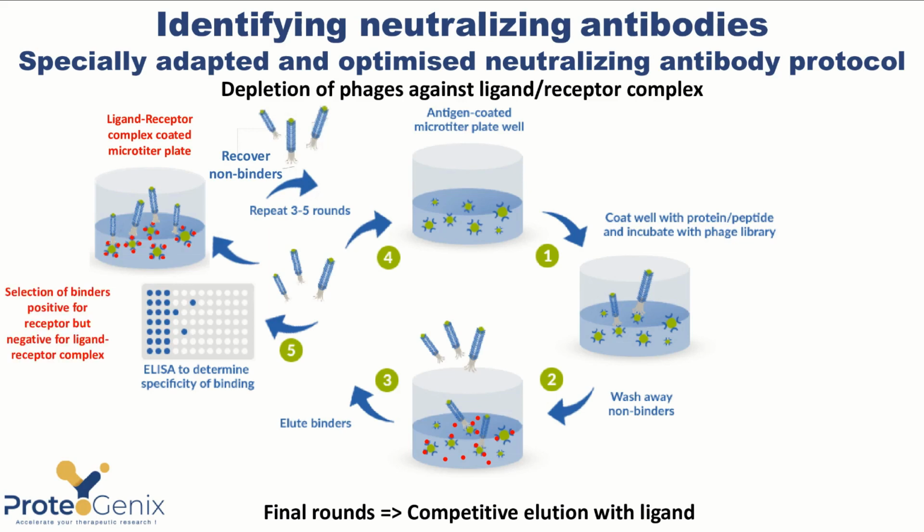This allows us to screen a specifically selected pool of phages whose binding to the site of interest is validated using a competitive ELISA, allowing us to identify binders positive against the receptor but negative against the ligand receptor complex, getting us our therapeutically active neutralizing antibody.